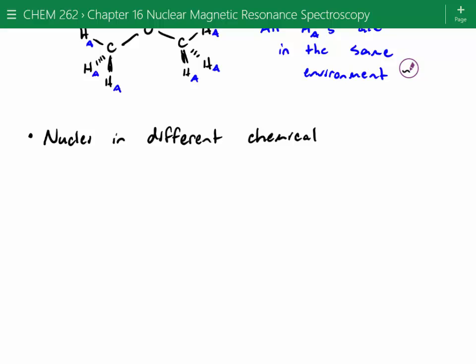Resonance frequency is, imagine pushing a kid on a swing. If you go up to a kid and you're just bashing them, they're not going to start swinging, right? But if you do nice slow pushes, you can actually hit their resonance frequency on the swing and get them pushing really far off axis. You just have to be pushing them at that right frequency. Essentially, that's what a resonance frequency is for a spinning charge, too.